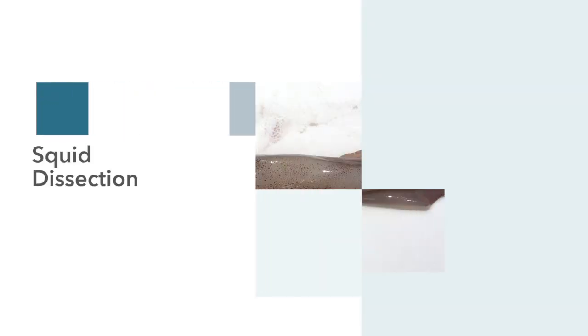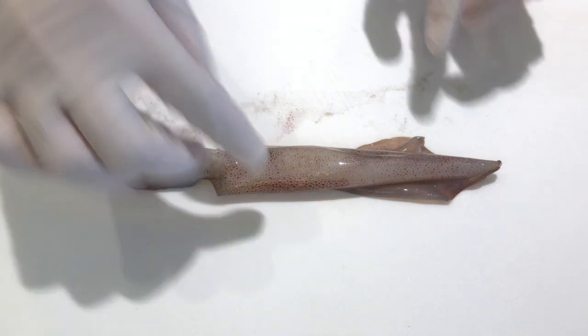Hi, this is Jesse from 8-5 and today I'll be dissecting a squid for my biology project. I'll start with explaining a squid's body parts.